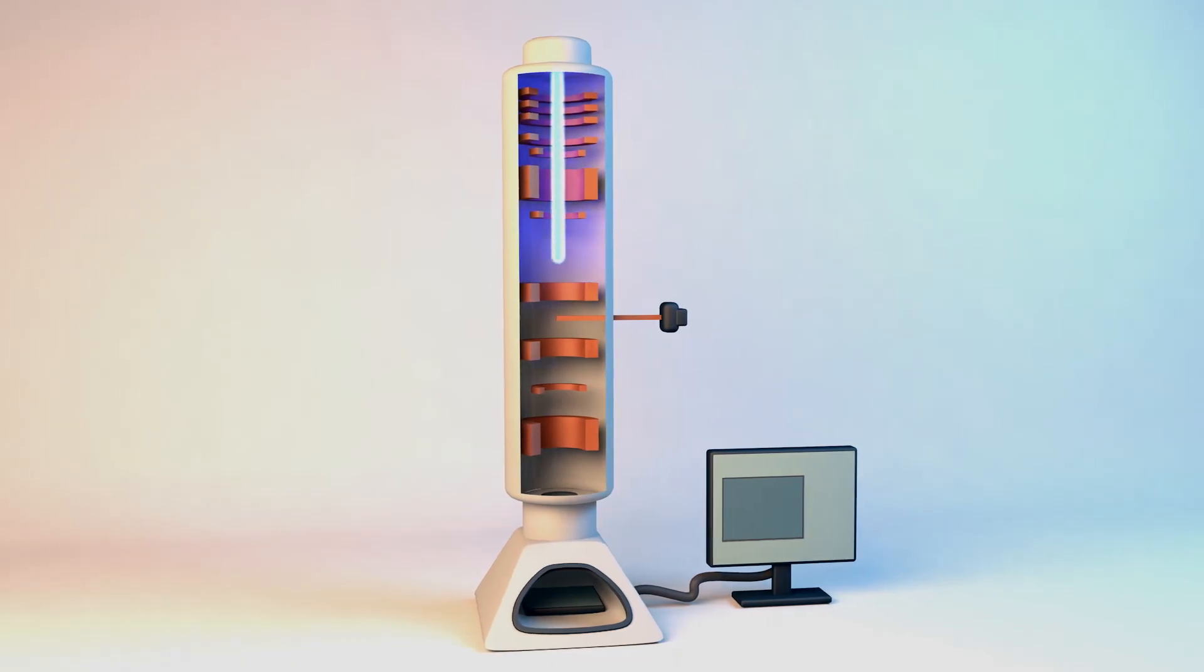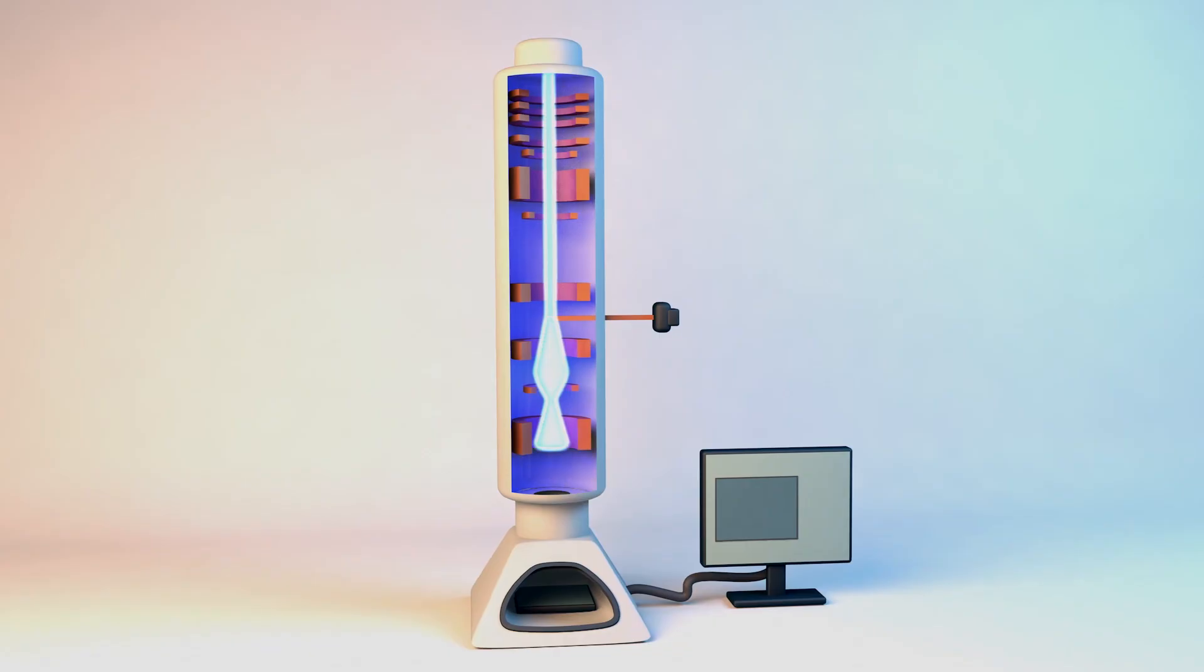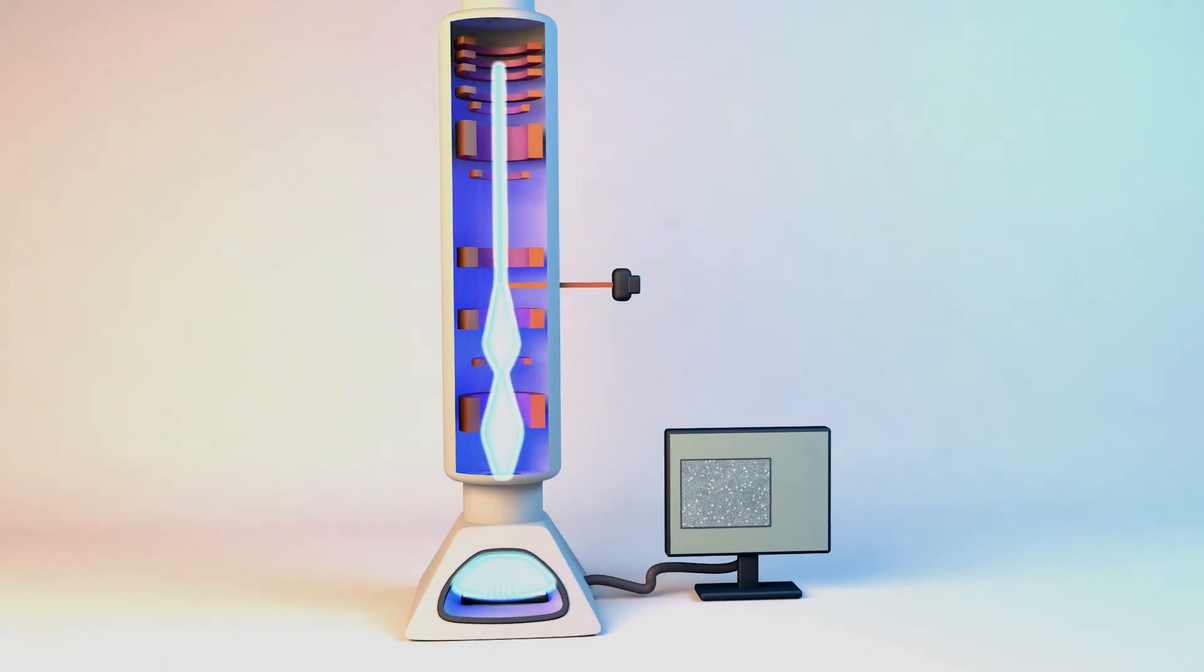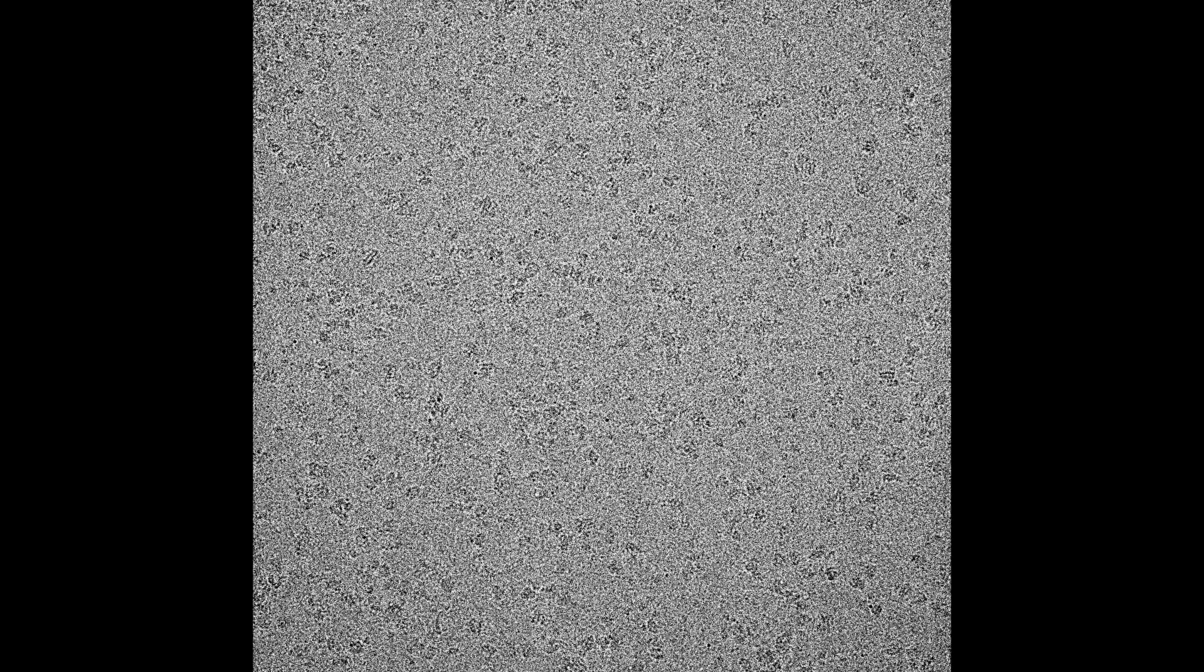Electrons are fired at the sample and detected by a camera to produce an image. The molecules in the sample are in different orientations.